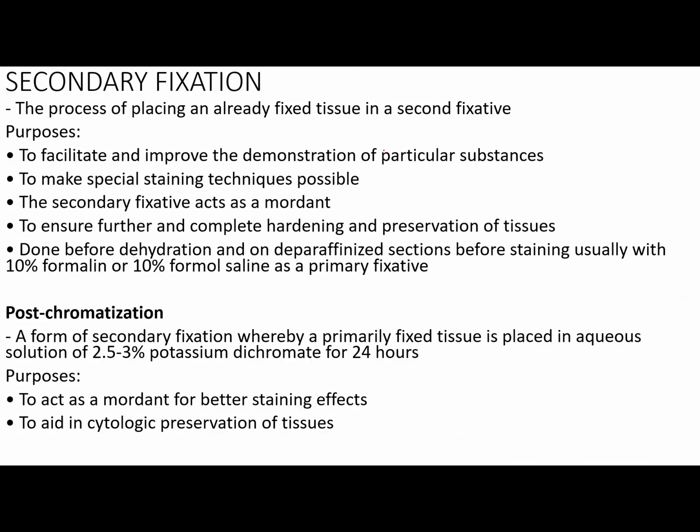Now the purpose of secondary fixation, please take note, is to facilitate and improve the demonstration of particular substances, make special staining techniques possible, and secondary fixative would act as a mordant. So it enhances the appearance of the cell. Then to ensure further and complete hardening and preservation of tissue.